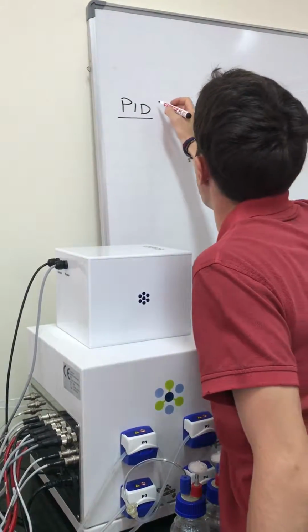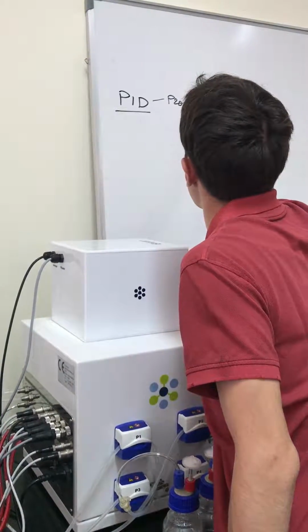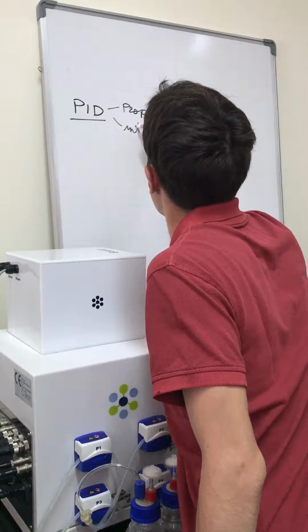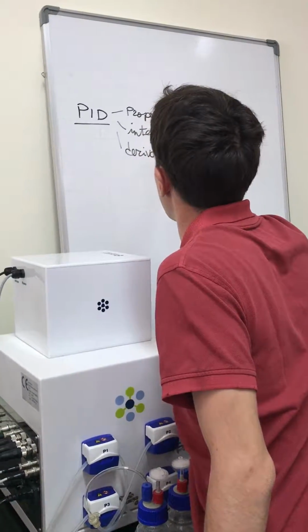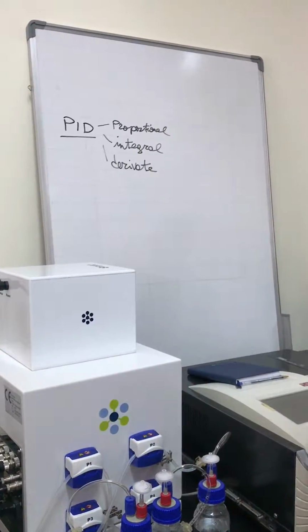PID stands for proportional, integral, derivative. They are mathematical functions.